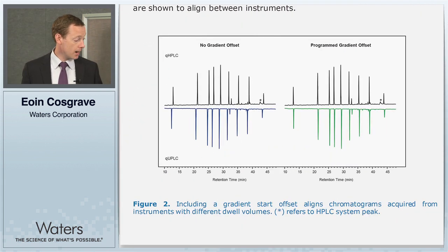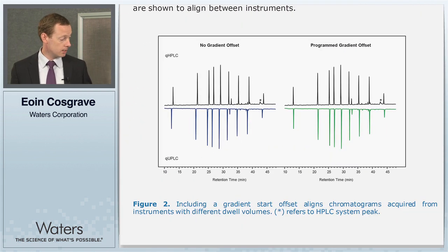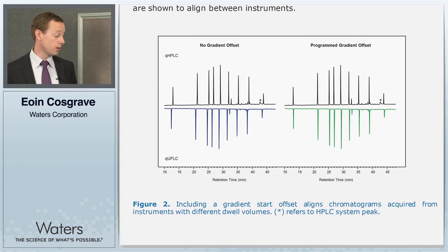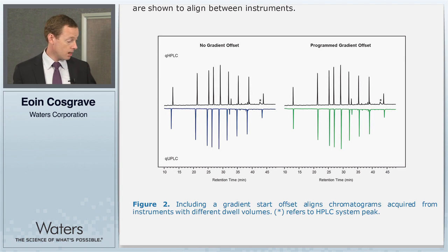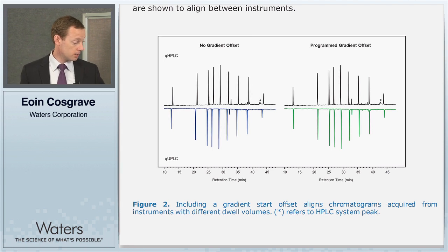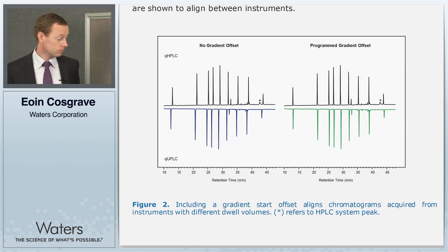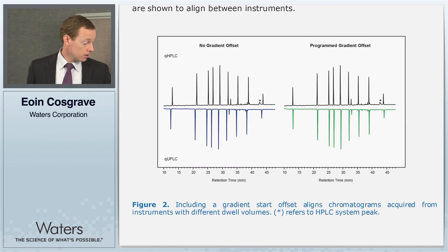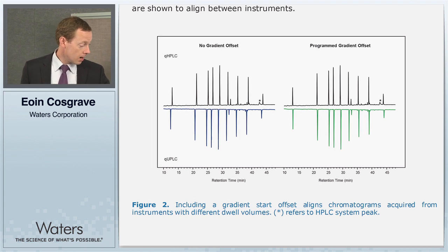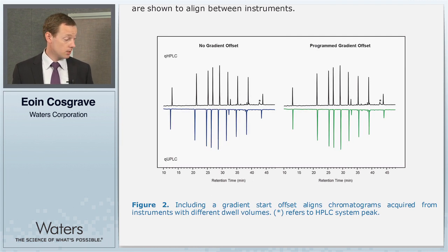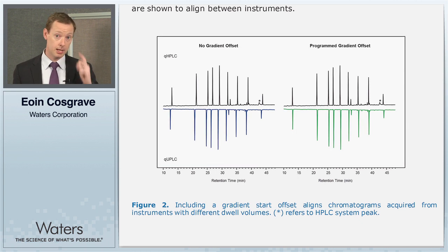When we put that into practice, the results presented in figure two show that in the absence of a gradient delay offset the chromatographic profiles are different. After we include the isocratic hold offset, the chromatograms align — and this is the effect that we would like to see with more complicated profiles.